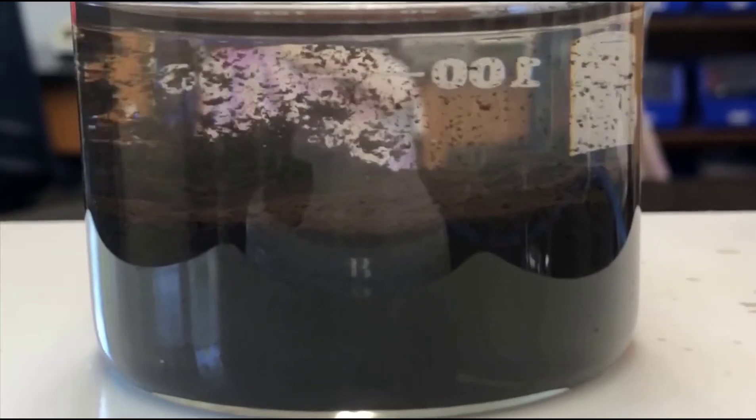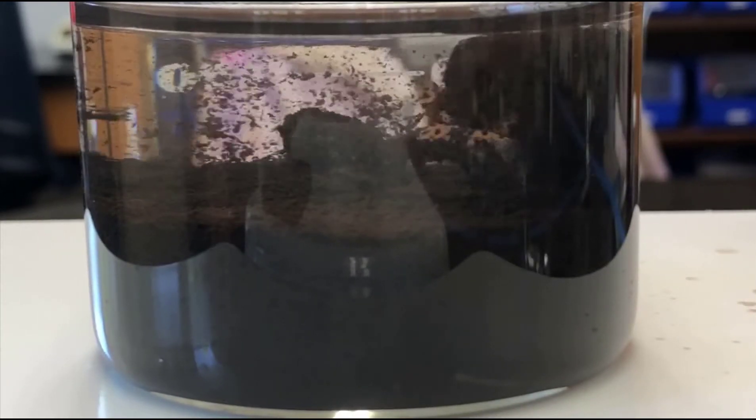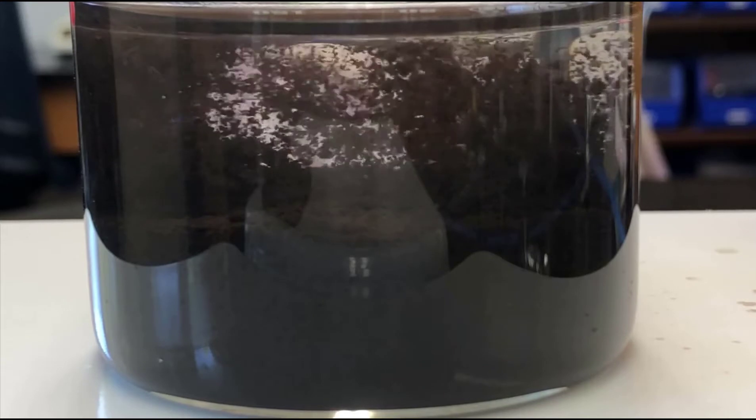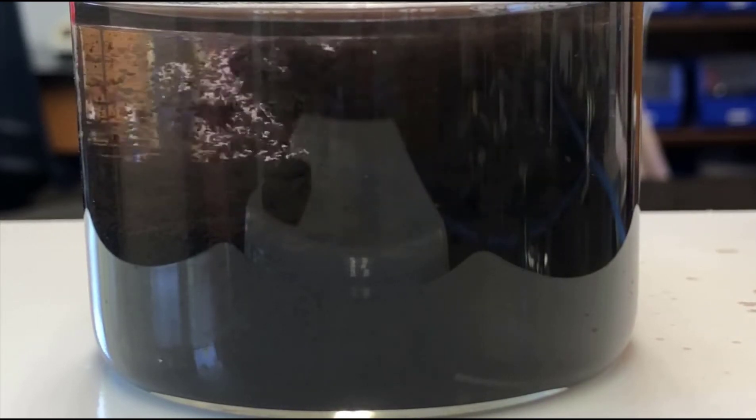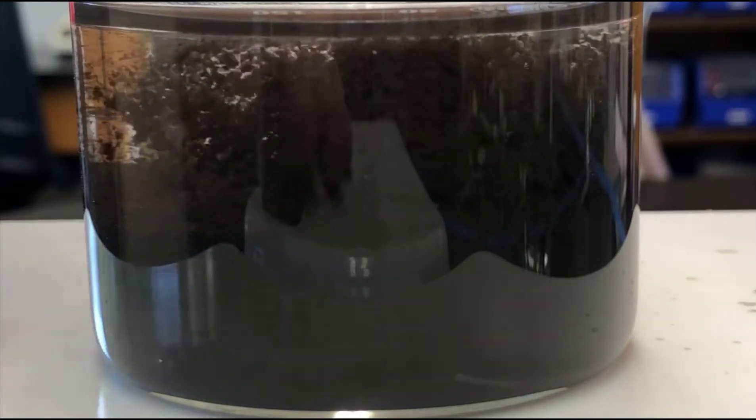This shouldn't bump violently at this point, but what will happen sometimes if you're heating it really strongly is that it'll actually blow all the material out of the beaker. So now I'm going to set it on a cool surface, which is actually just another hot plate.